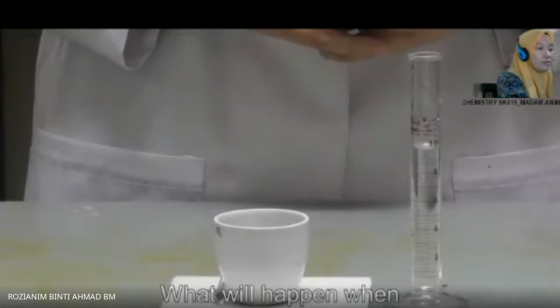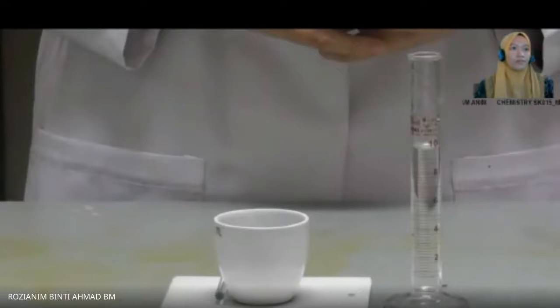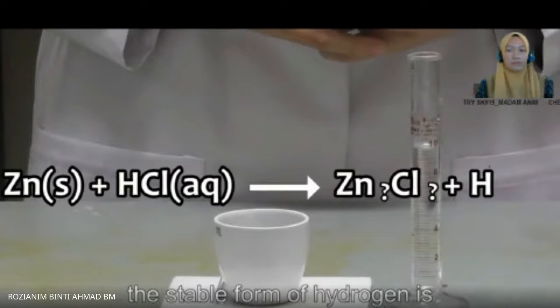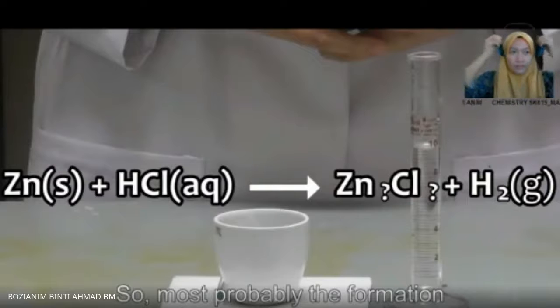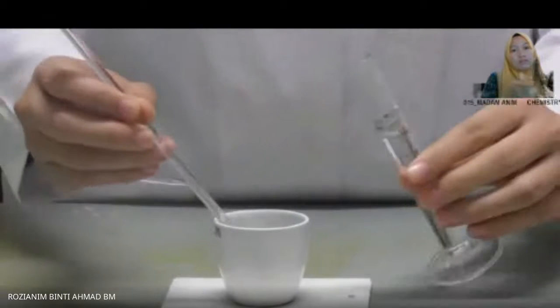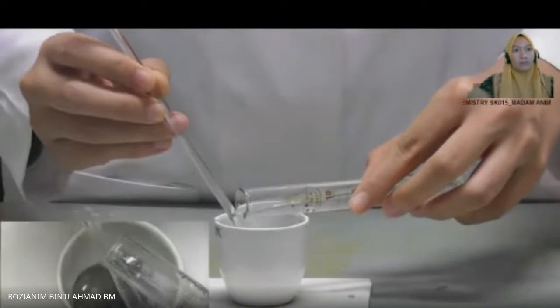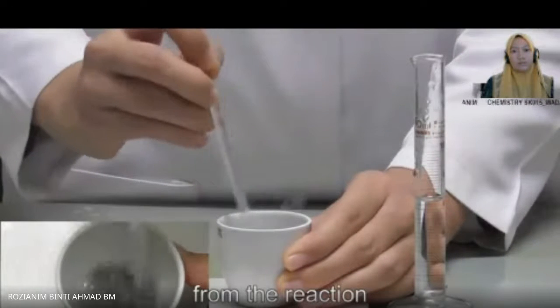What will happen when hydrochloric acid is added to zinc? What will be observed? The observation can be predicted by referring to the chemical equation. At room condition, the stable form of hydrogen is a diatomic molecule in gaseous state. So most probably, the formation of gas bubbles will be observed. Hydrogen gas is liberated from the reaction of zinc and hydrochloric acid.